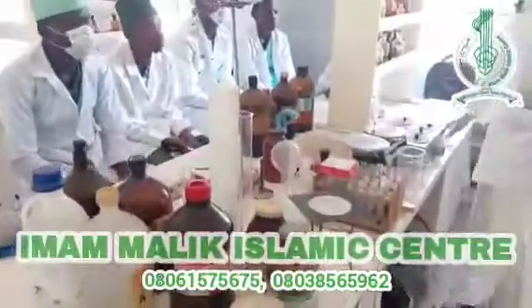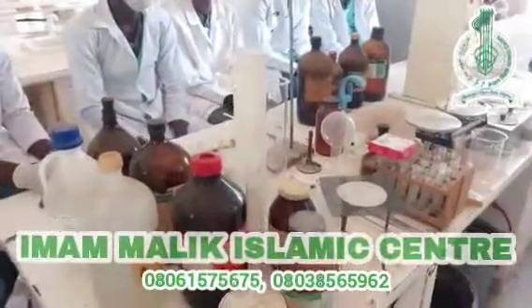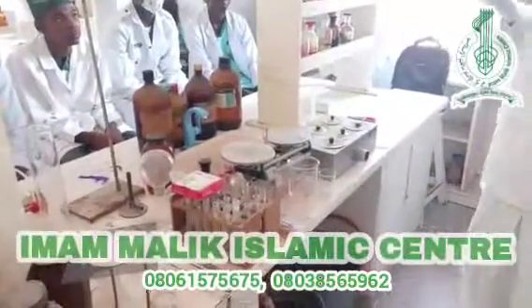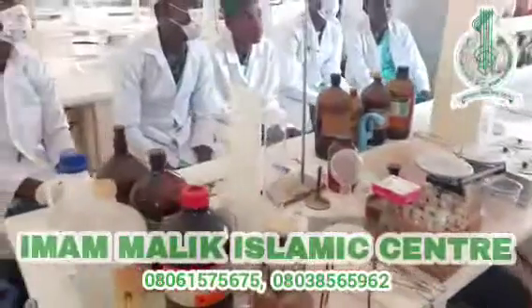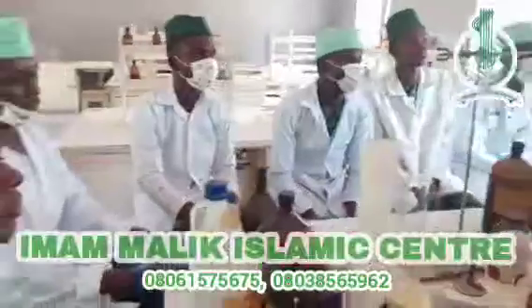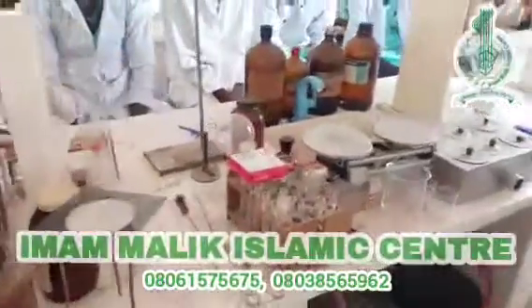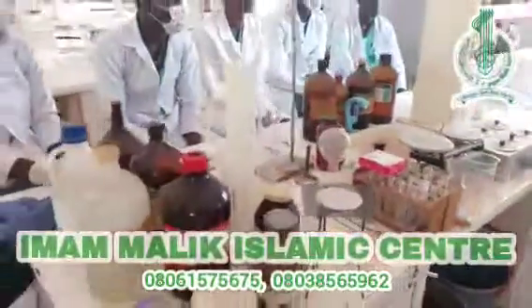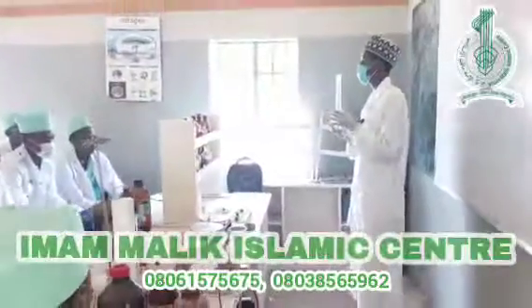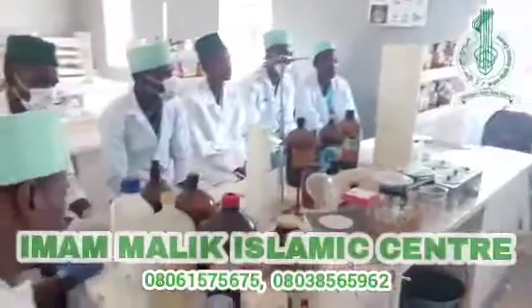Others are designed for several purposes, like the volumetric flask. So this is our volumetric flask, and it is graduated 500 mL or 500 cm cube, almost a half dm cube, 0.5 dm cube. It's just the unit that differs actually. So it is used to prepare solutions with accurate volume.